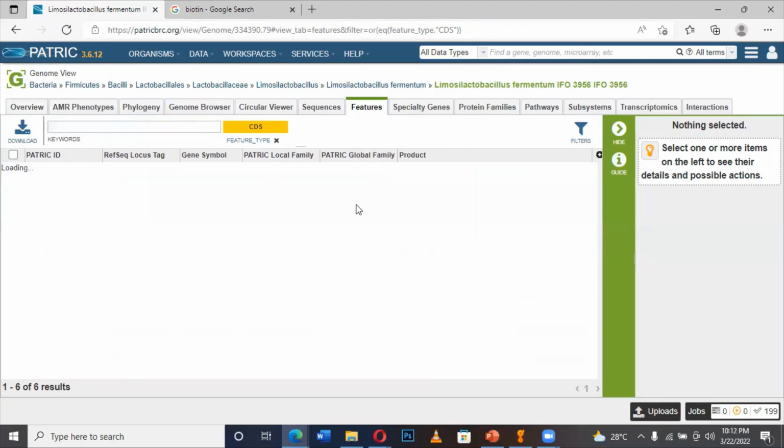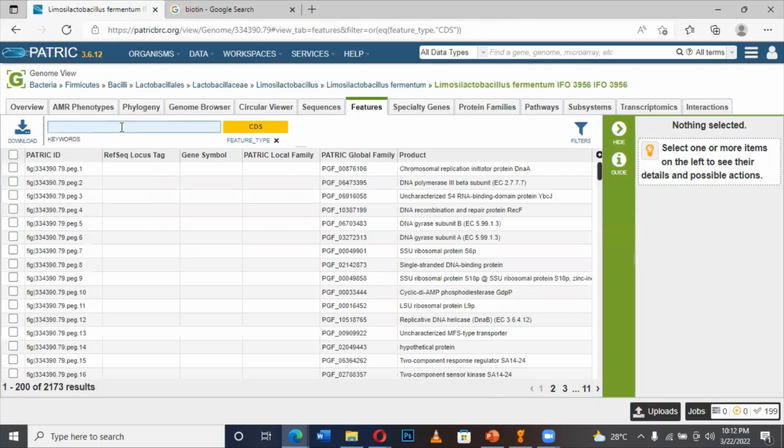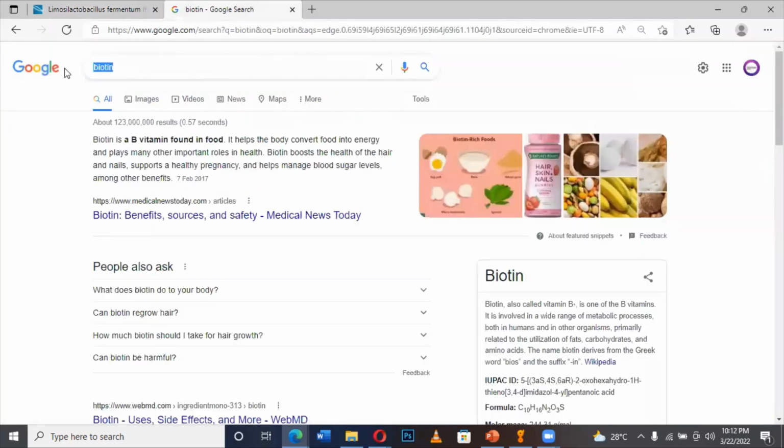So you could narrow down your gene of interest based on anything you have in mind, all right? Based on your desire, your research, what you're doing. All right, we have what we call mobile gene elements. And okay, let's just try to search what is mobile gene elements.